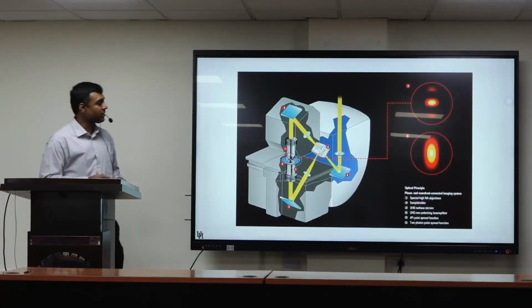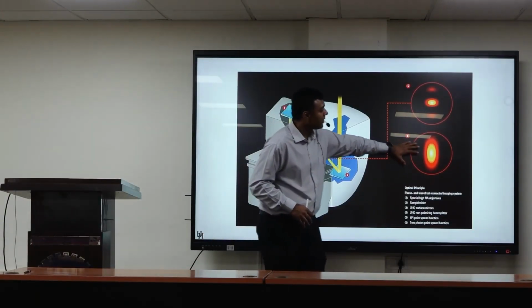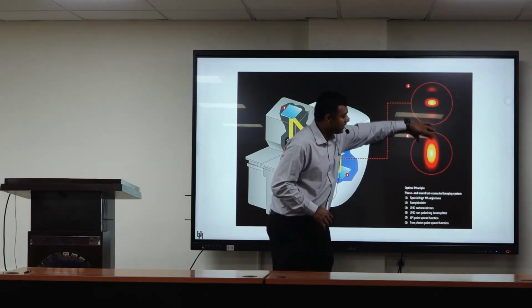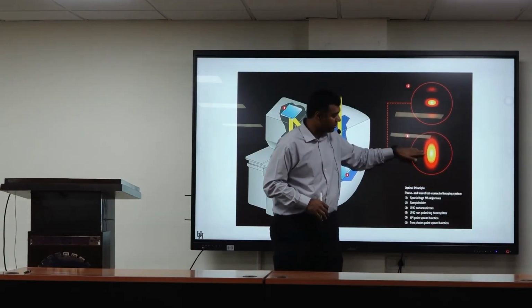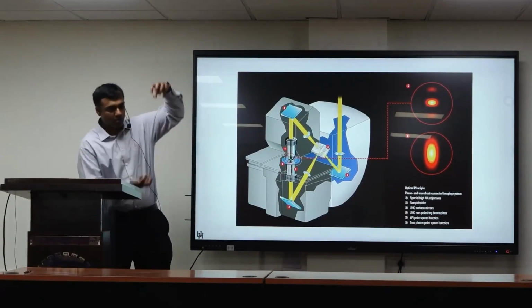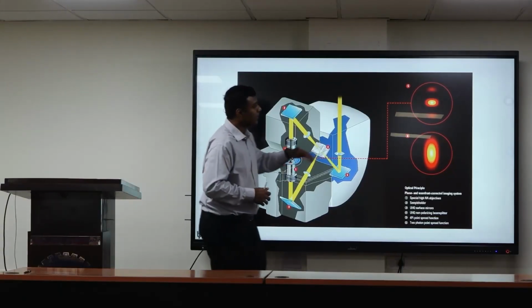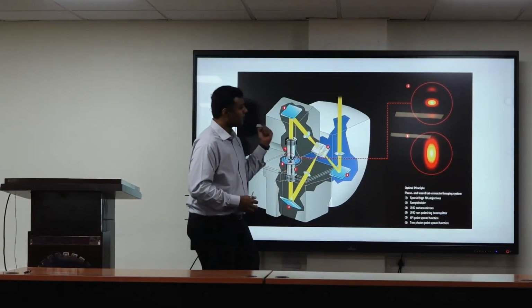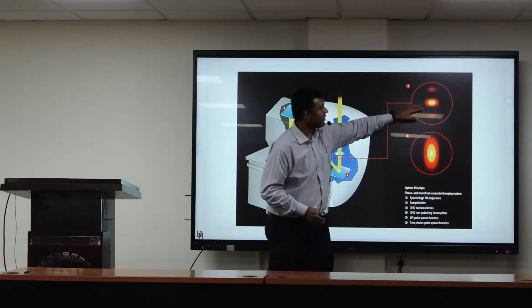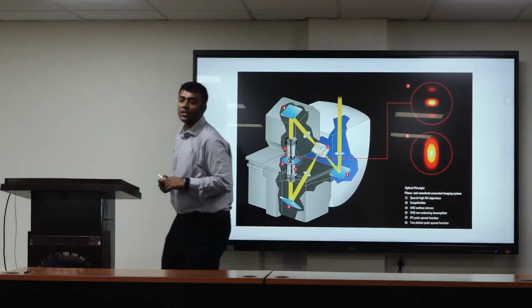Okay, so here is the comparison. This is the regular confocal microscope, and it's an oval shape, right? In XY you get good resolution. In Z it's a little bit worse resolution, because the point spread function is elongated. That's the nature of light focusing. But because your light is coming in from both directions, the point spread function is narrowed and it's even smaller, especially along Z, right?